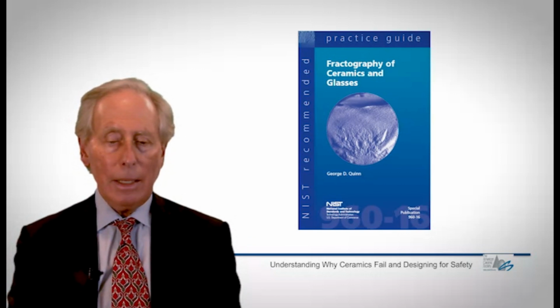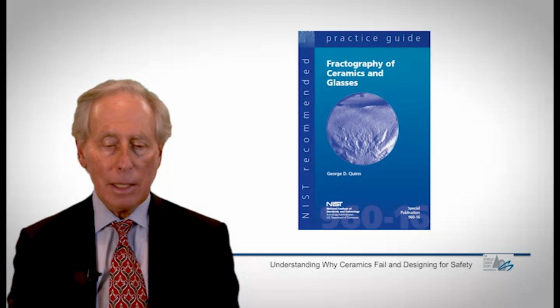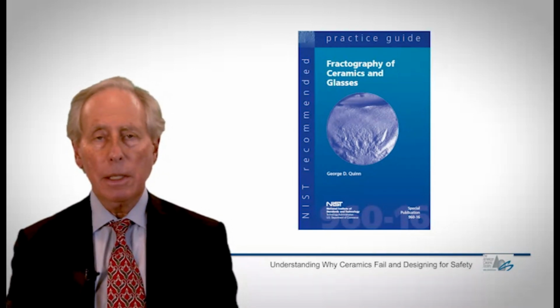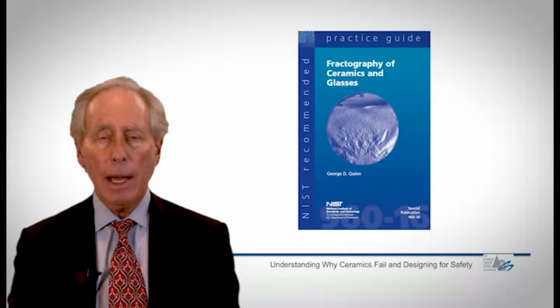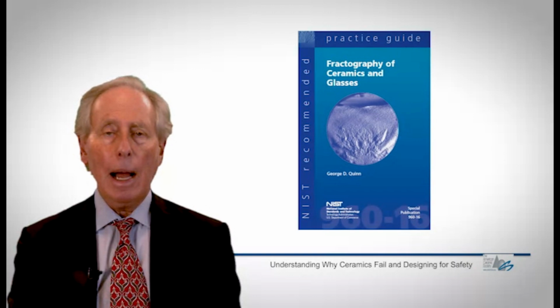For the Bible of fractography, I recommend this NIST practice guide written by my colleague George Quinn. He probably is today the world-recognized expert on fractography of ceramics and glass. And this contains a myriad of details into how to do fractography. I will show you some of the things you can learn from fractographic analysis.